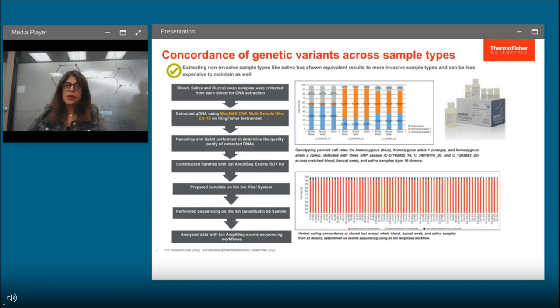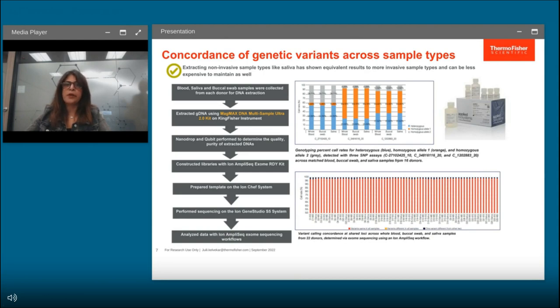Several techniques and sample types are currently used for nucleic acid extraction, including lower respiratory fluid, nasal swabs, brush biopsies, nasopharyngeal swabs, saliva, blood, and more. Saliva has emerged as a promising sample type for diagnosis of infectious diseases and genetic applications as a non-invasive collection technique. The Applied Biosystems MagMax DNA Multisample Ultra 2.0 kit can extract nucleic acids containing genomic DNA from multiple sample types, and can be automated by pairing with the magnetic bead-based KingFisher purification system.